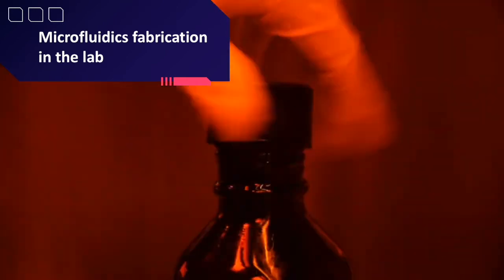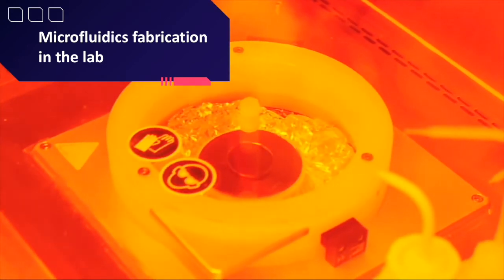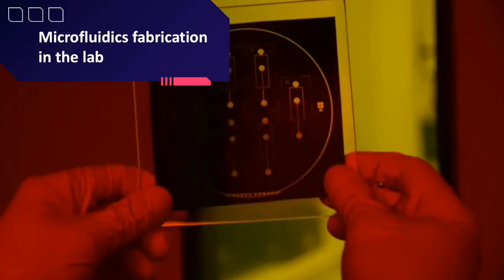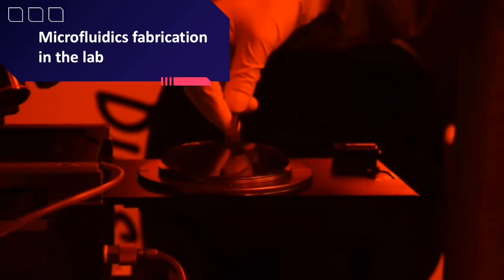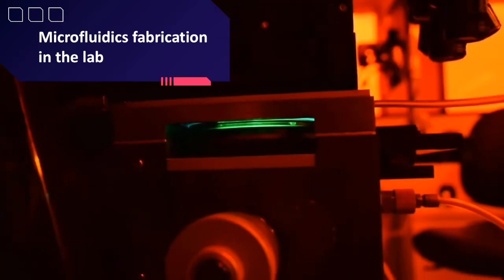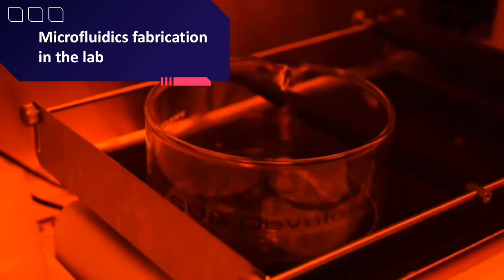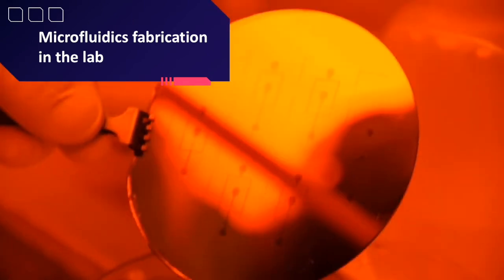We take a silicon wafer and pour resin on top. We spread it by spinning it very fast and heat it up to solidify the resin. Then we take the mask and put it in the lithography machine. We also put our wafer with the resin. We light it up, take the resin back out, heat it up, and develop it. We get rid of the non-lit up parts with a solvent. We clean it, and the mold is ready.